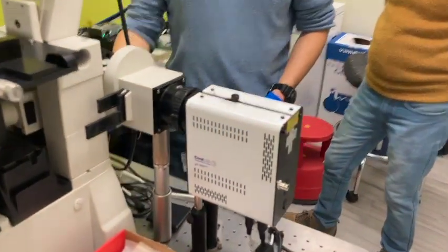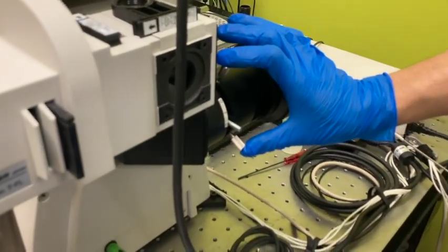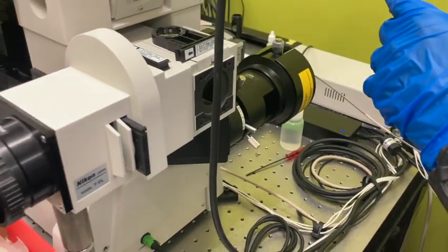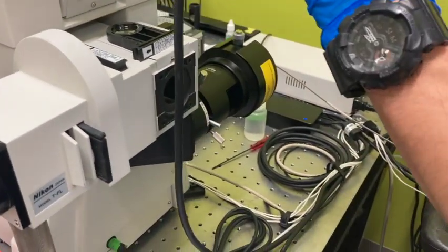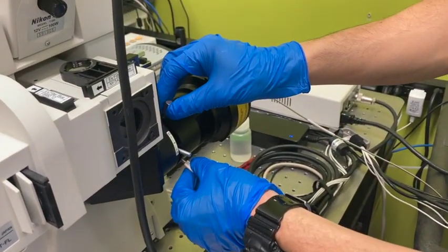And also, this tool is to adjust or to center the aperture onto the camera. So if you find the field is kind of not in the center of that movie, you can adjust this.